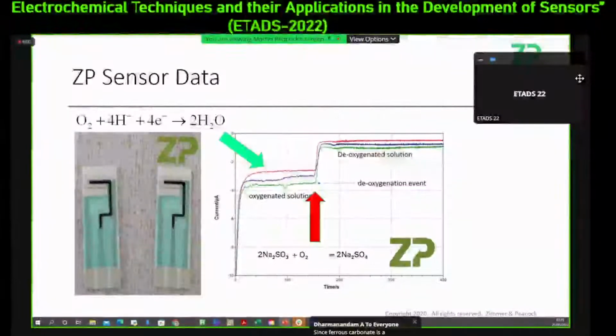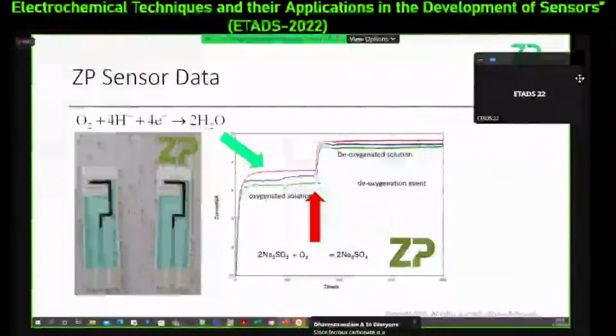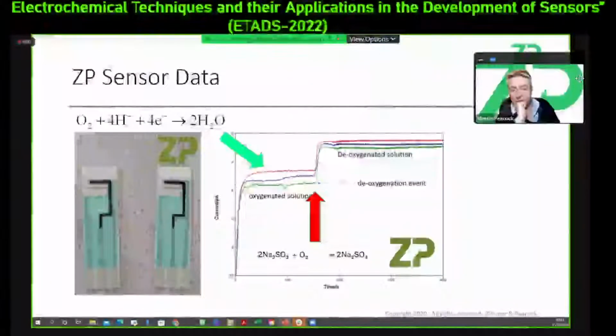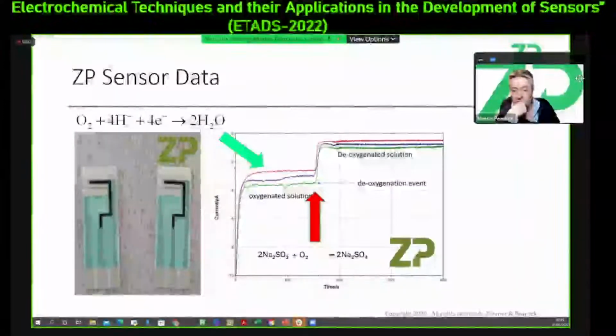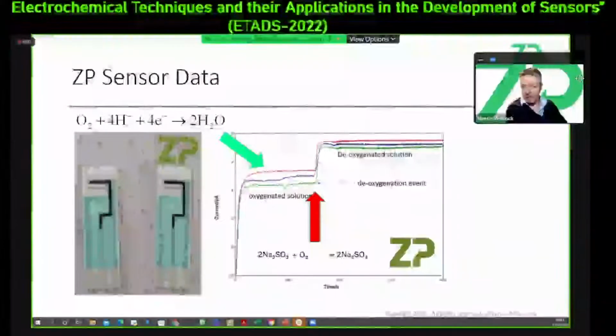Yeah, thank you, sir. And one more question from Dharmanandam, Vivekananda College. Why did you choose a non-ferrous oxygen scavenger? It's interesting actually, because I can see here that they've written ferrous carbonate is typically used as an oxygen scavenger. To be honest with you, I didn't know that, so we might give it a go. If it's less toxic or just as good, then we would maybe use that instead. I can see why the ferrous carbonate could become ferric carbonate. So I could see why that works.